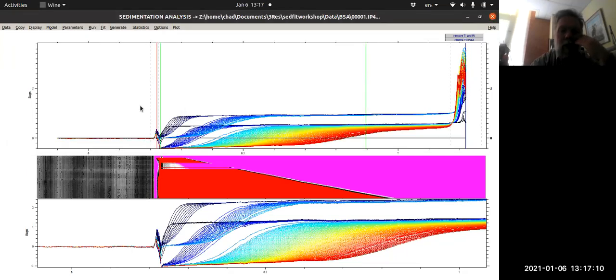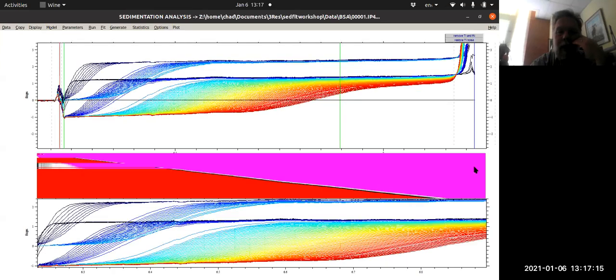If you right click, you can draw a box around your data and you can actually zoom in on it. So here's our data, and it has a couple of interesting features. It looks like good data, but it's actually jumping up and down. And so there's a thing, if you look at the height of this black line versus this lower blue line, it's almost quantized on this y-axis in terms of fringes.